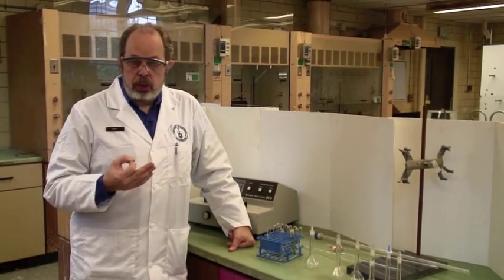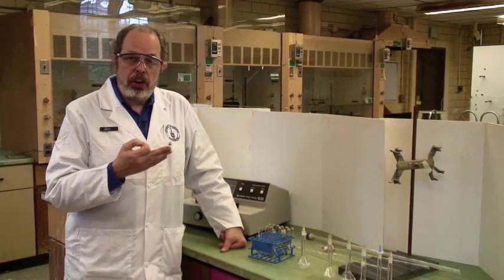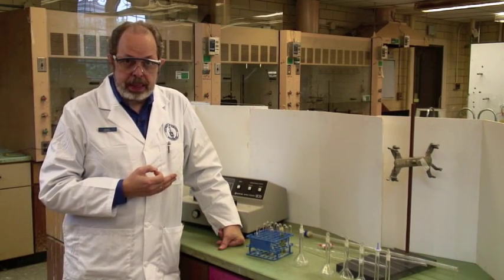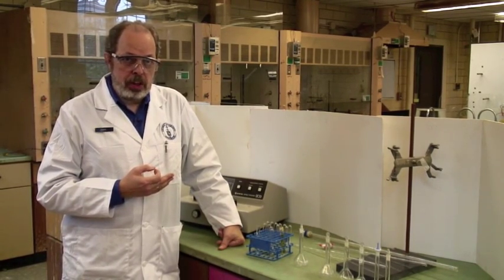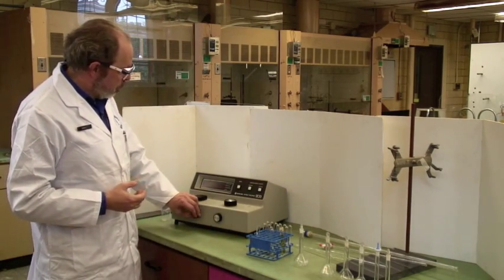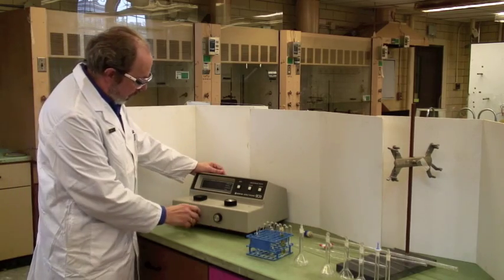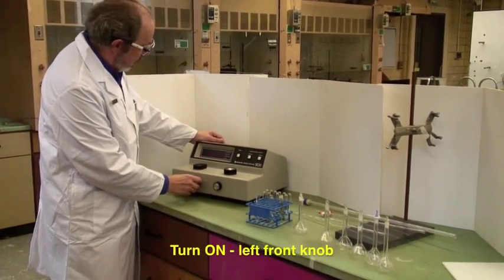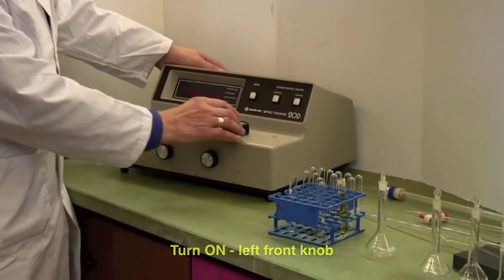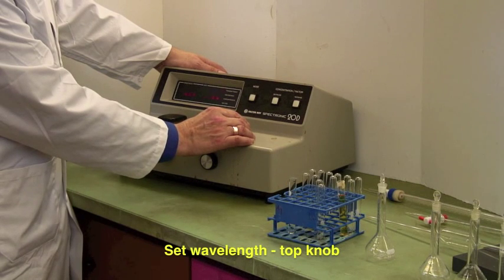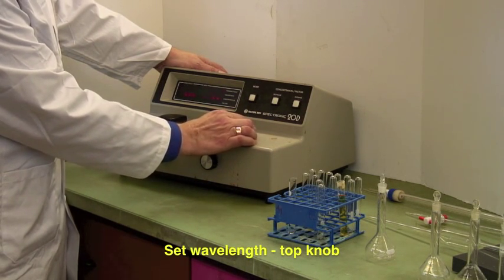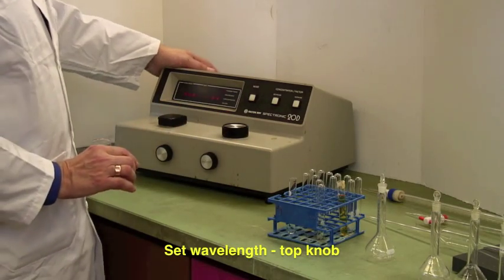You will, in all cases, be monitoring how much of the colored ligand you have produced using a SPECT20. You have used a SPECT20 before, so I'll just give you a quick review. The machine is here, and you turn it on with the left-hand knob here. The first thing you're going to do is set it to the appropriate wavelength. I'm going to use 509, which is exactly what I want.